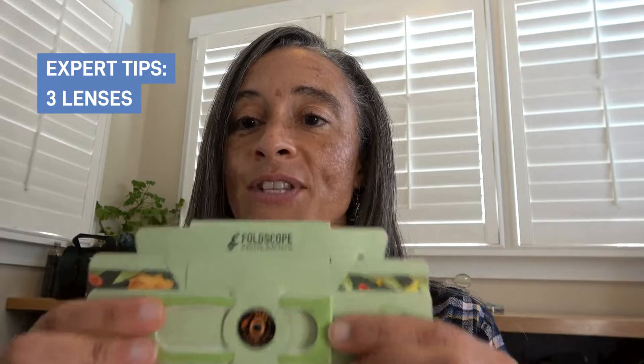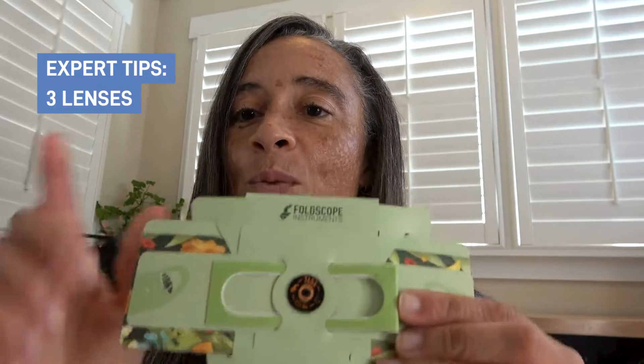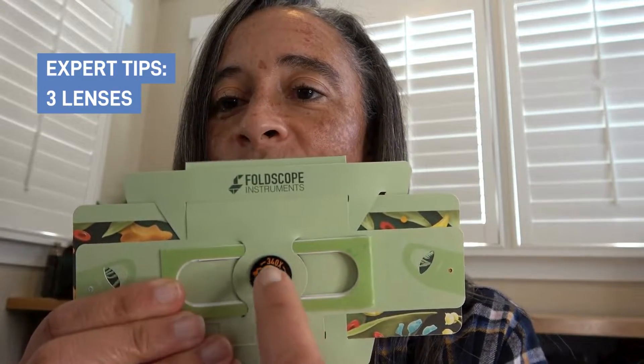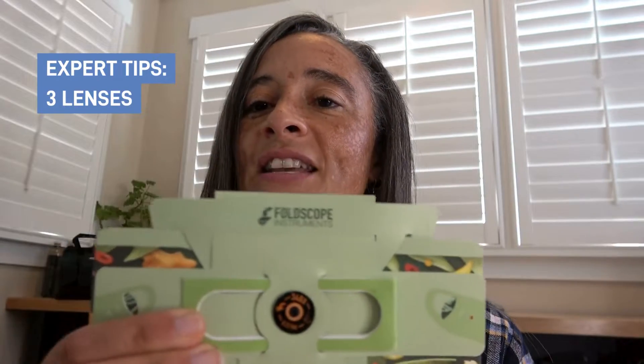If you find that no matter how hard you try, you cannot get your sample to come into focus, one trick that you can try is — if you look here — you see how we've got the lens attached on there.